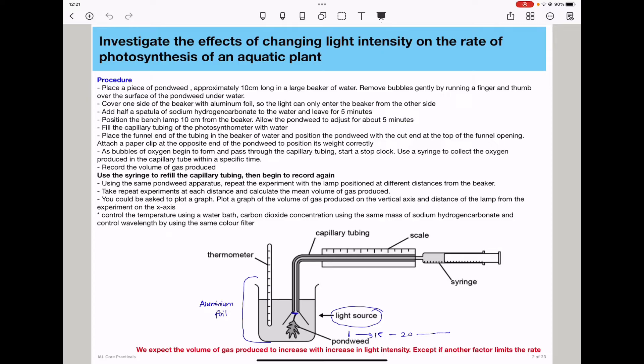The experiment has to be carried out within a specific time that is going to be consistent for all experiments studied. You need to have carried out preliminary experiments in order to state the appropriate time for which you will carry out this experiment. So you have to record the volume of gas produced within that specific period of time. You can see this is the capillary tubing that will be filled with water in the beginning, but as bubbles of oxygen gas are formed, they are going to travel in here and there is going to be some displacement. In the end, we will use a syringe to refill the capillary tubing and then begin to record again.